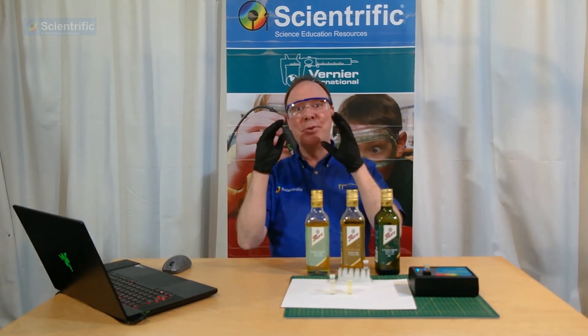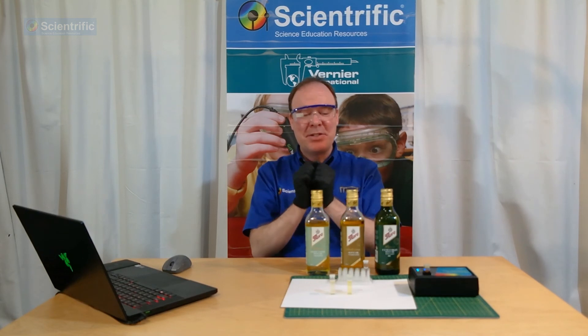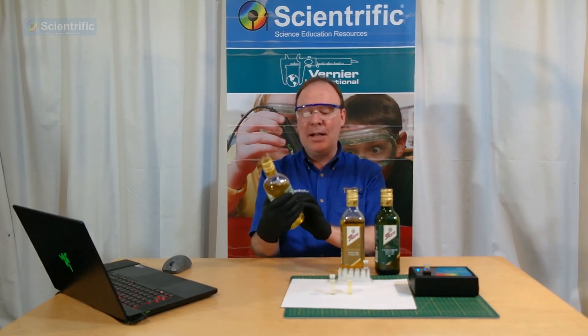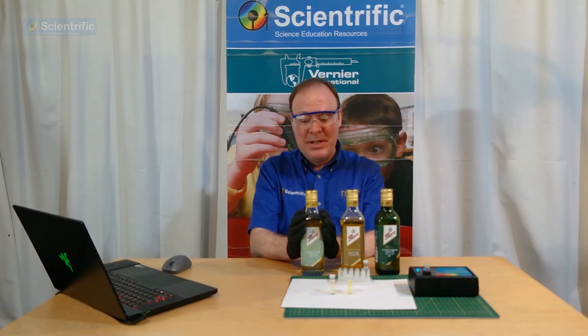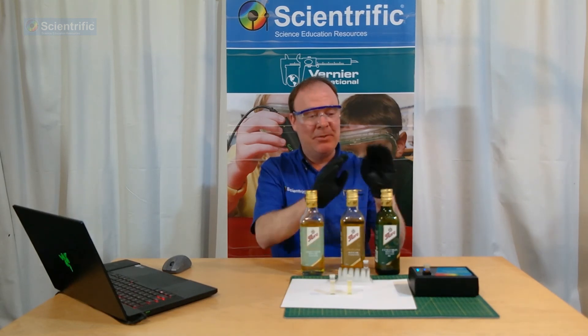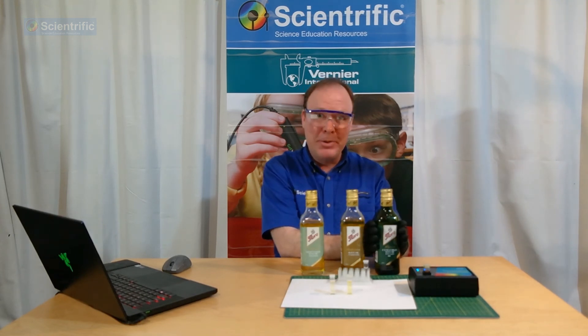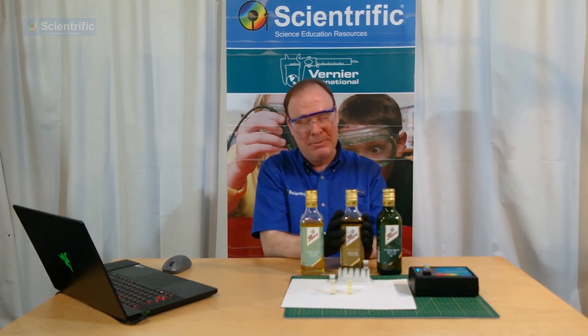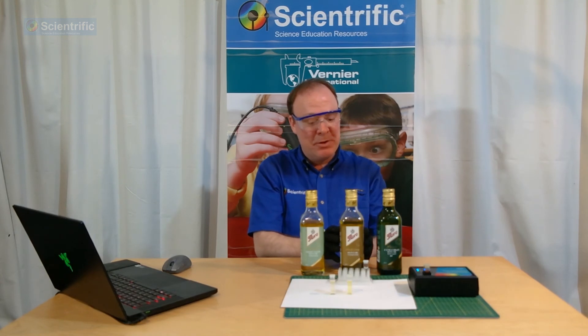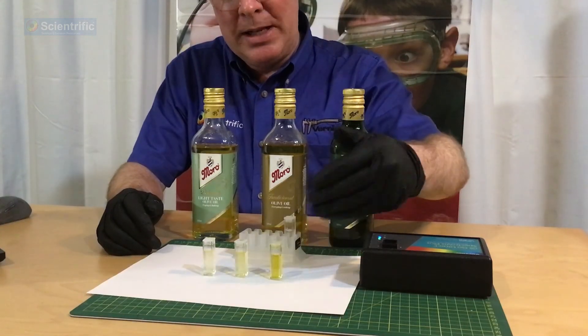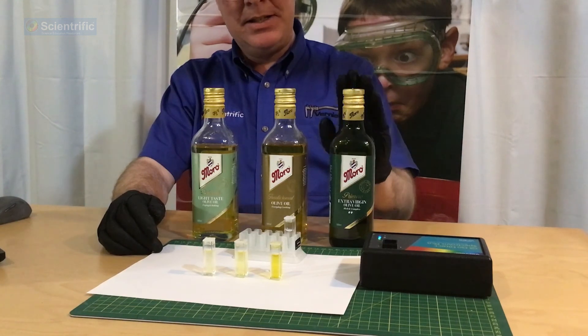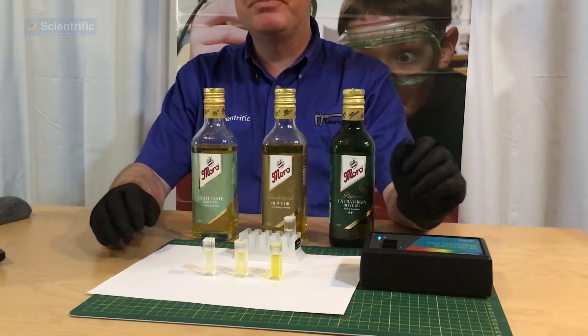You can see from the graph very beautifully that there are three different peaks. We can say for sure that the light taste olive oil has the least amount of chlorophyll. This is the processed oil with all the grapes and slurry after they've done the first two. The extra virgin olive oil is done with the first press, so it has the highest level of chlorophyll, and the standard olive oil is in the middle. They all look very similar in color—they're all yellows—however, you can definitely see this one is a much deeper yellow because of the level of chlorophyll.